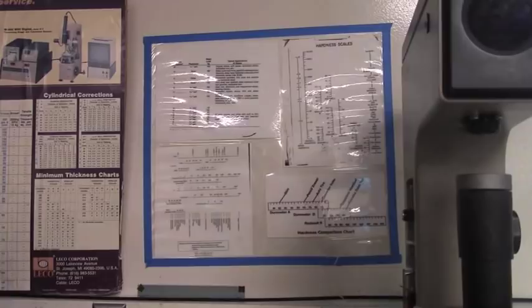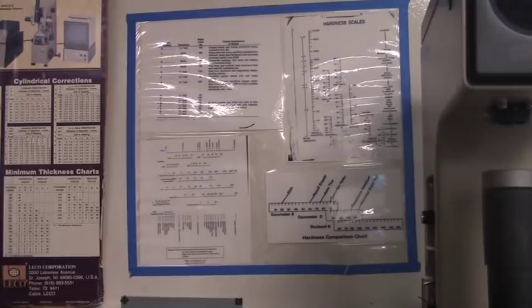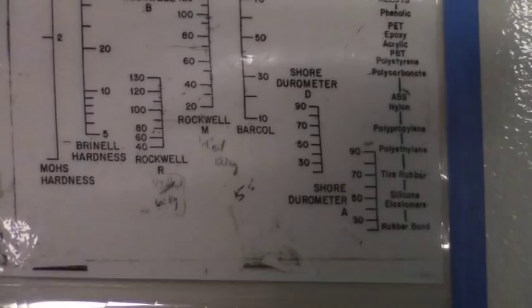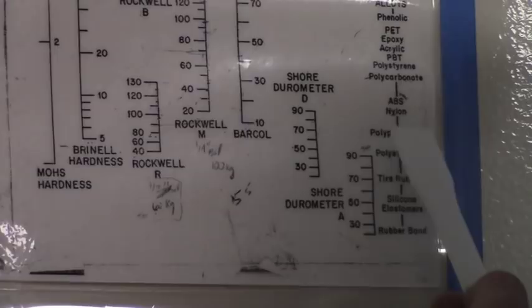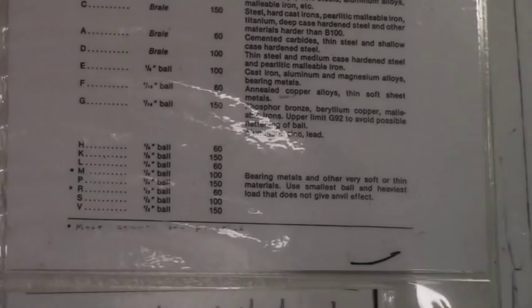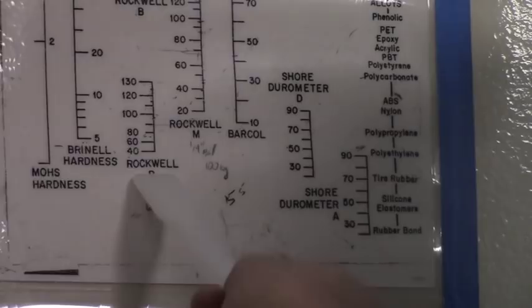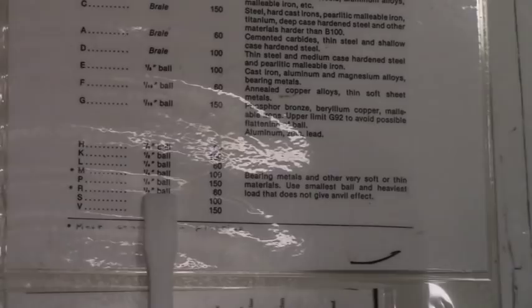A chart is located behind the hardness tester. Use this to decide on the correct scale. The scales are denoted by a single letter, which determines the load and the indenter that will be used. The R scale is appropriate for most plastics. For extra precision, a blue binder beside the hardness tester has a table of the appropriate scale for specific polymers.